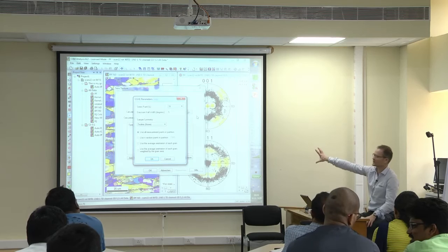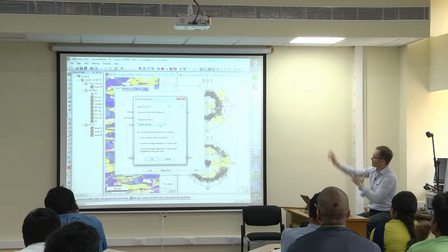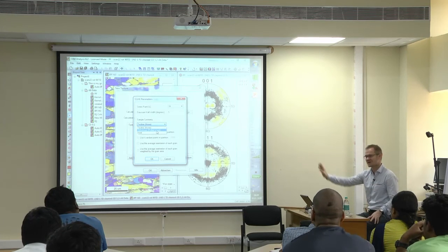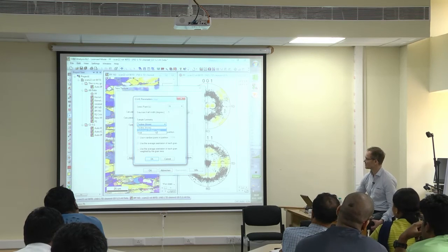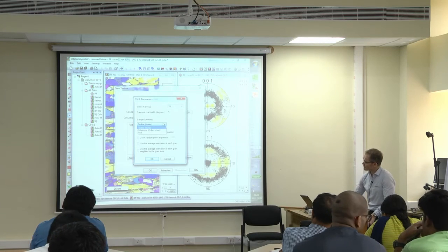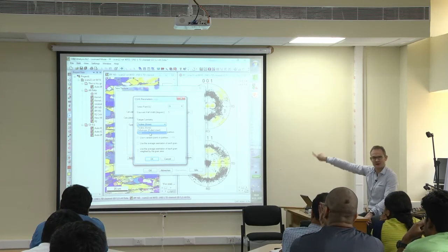If you say, oh, my measured pole figures are sufficiently symmetric, so they show an orthotropic sample symmetry, then you can say, okay, I want to calculate as if it is perfectly symmetric. And then it will calculate a texture which has orthotropic sample symmetry, and you will see then it's perfectly symmetric because the program enforces symmetry. No? If you use triclinic, then it will not have sample symmetry, and you can also have an axial symmetry, then it will rotate it all around there. No?